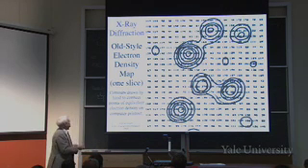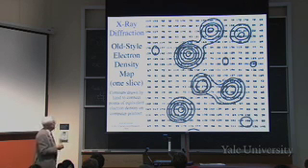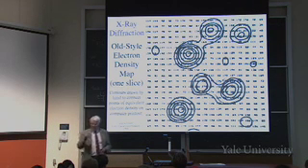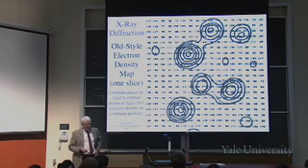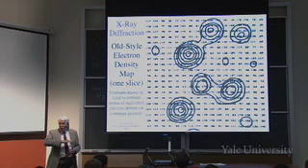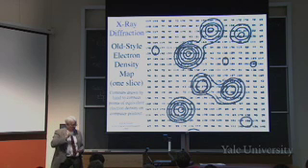And here's where that was done for a particular compound. This is taken from a book written at that time by Stout and Jensen. And you drew these by hand because you didn't have a computer that could figure out where to draw it and so on. So here were atoms in a particular crystal structure. Then you had a whole bunch of sheets of paper for different slices through the electron density. Stack them up, right?